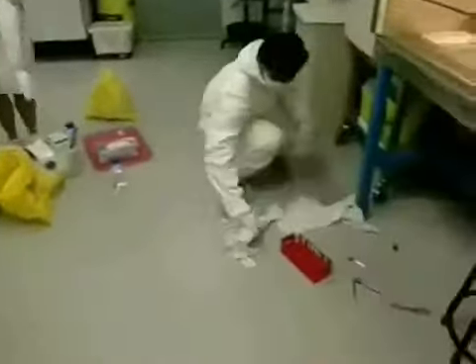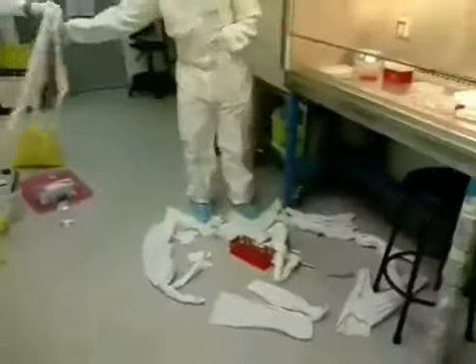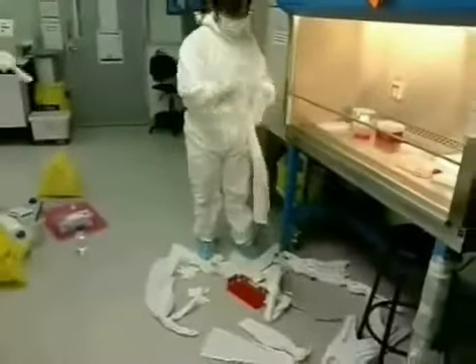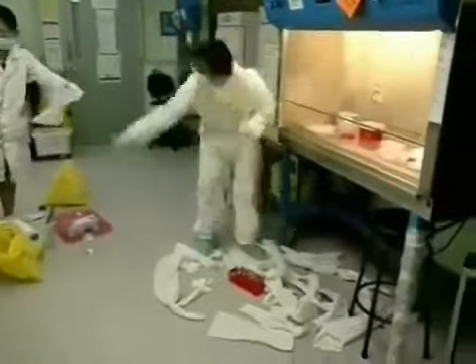It's the wrong absorbent material used. Oh dear, you've just touched the stool with contaminated gloves. I think if you had used the proper absorbent paper, you wouldn't waste so much.